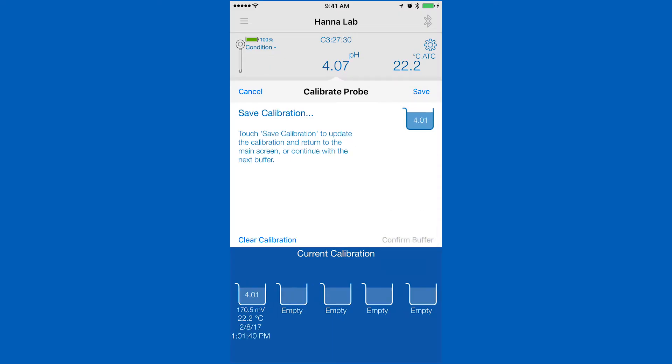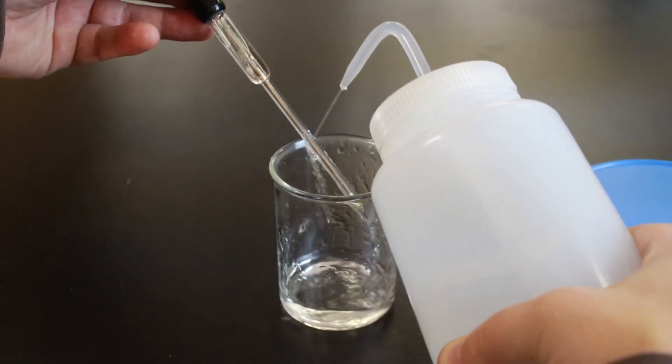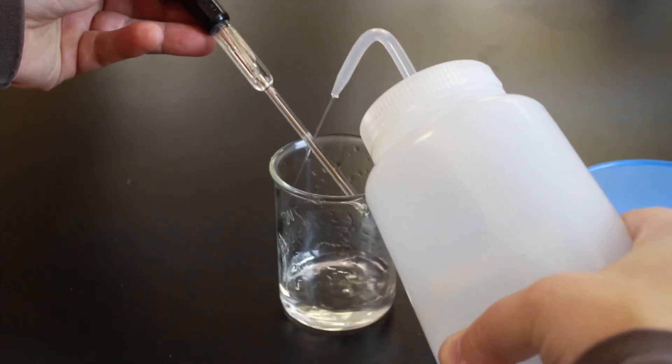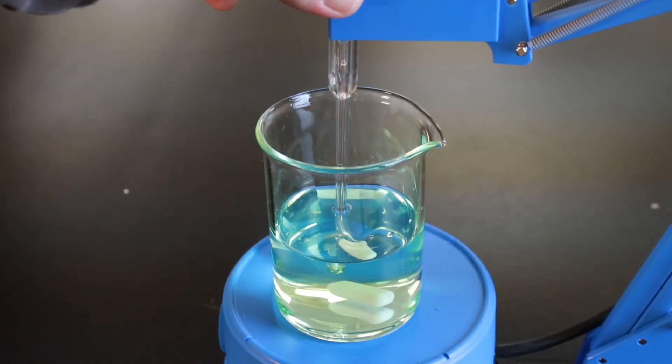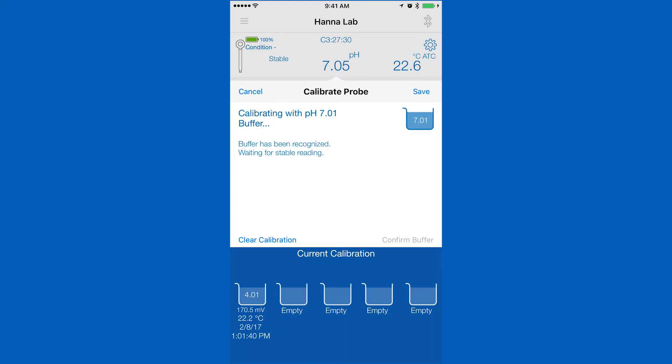To calibrate the next point, first we recommend that you rinse your electrode with deionized water to prevent contamination. Place in the next buffer and your saved calibration will be stored and our app will begin calibrating your next point.